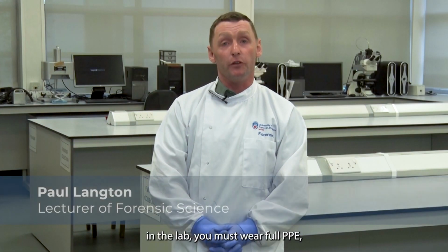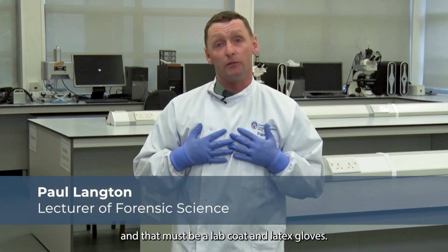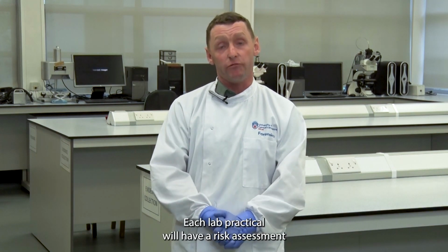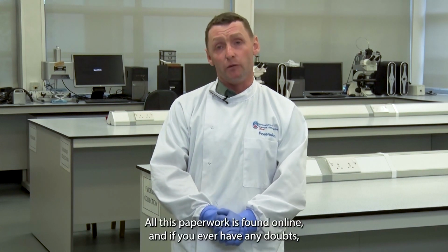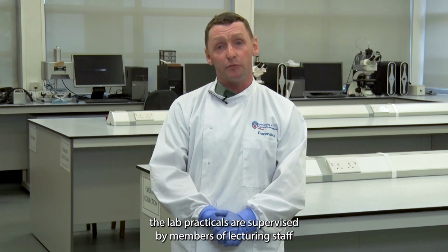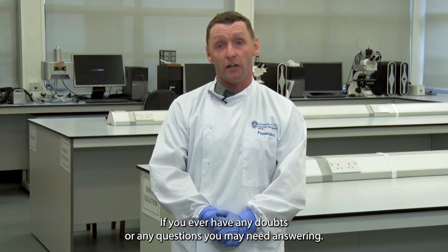So when working in the lab, you must wear full PPE, and that must be a lab coat and latex gloves. Each lab practical will have a risk assessment and COSHH paperwork, which includes the chemicals in use. All this paperwork is found online, and the lab practicals are supervised by members of lecturing staff, so you must ask questions if you ever have any doubts or anything you need answering.